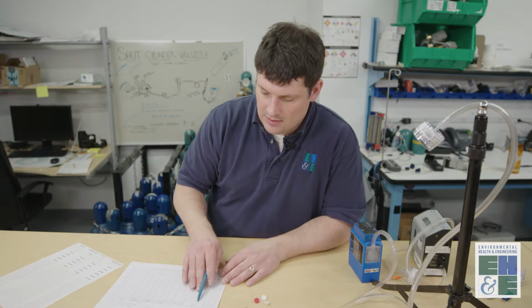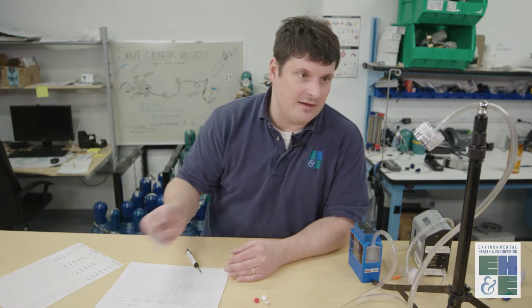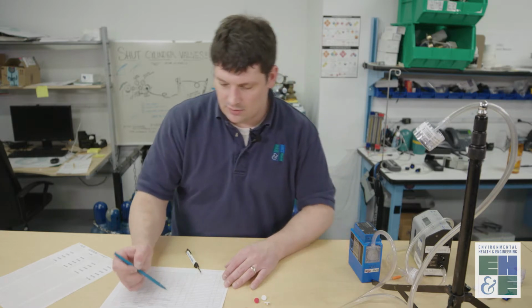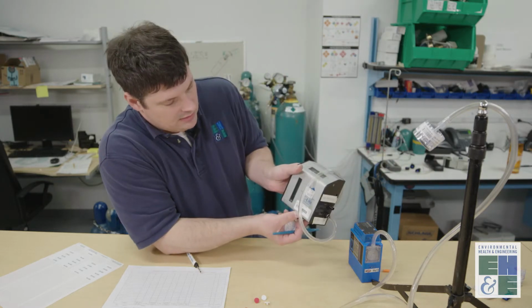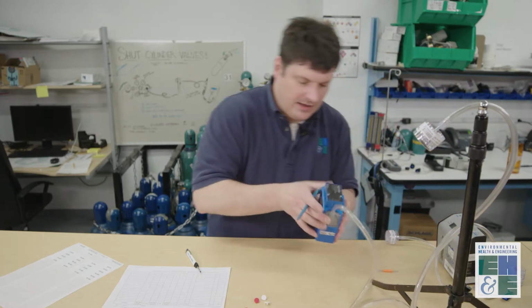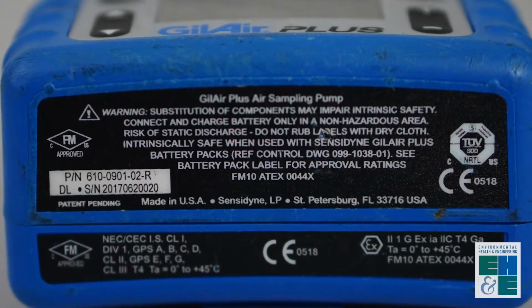the floor, the location, the QA type, whether it's a primary sample, a duplicate, which would be two samples side by side for the same duration, a field blank, or a media blank. I also want to record the rotometer ID, which in this case is on the EH&E barcode here. In this case, there is no barcode, so we'll record the serial number, which is right here.